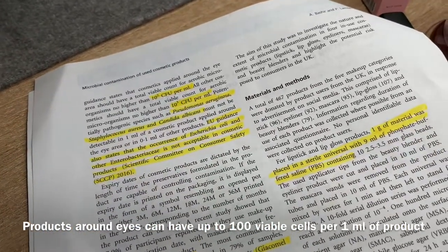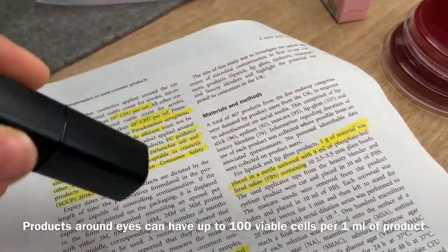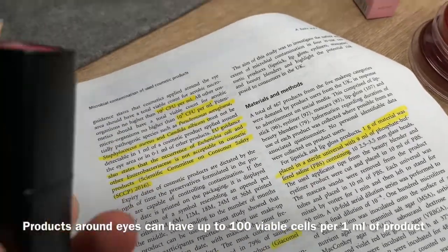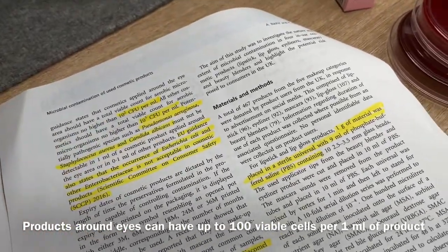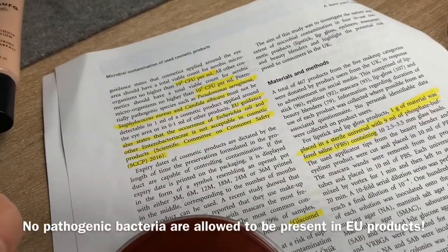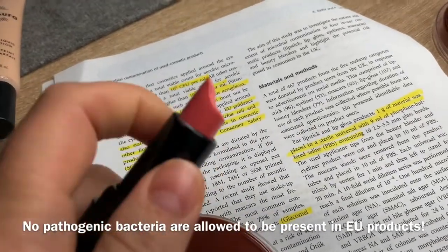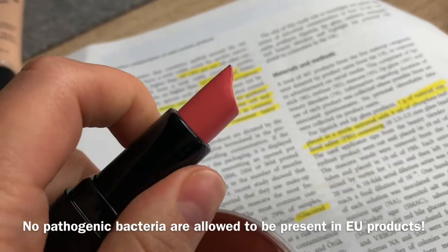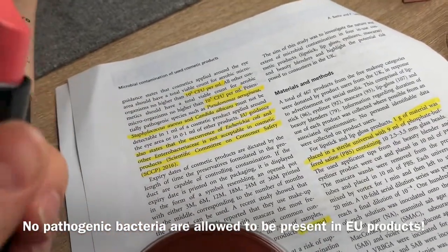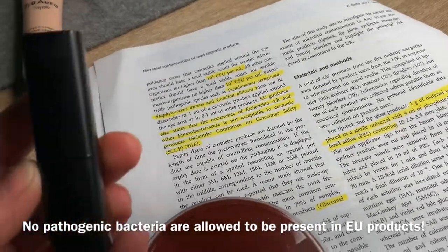You can expect in everything else like lipstick about 1,000 bacterial cells per milliliter. This was not a perfect experiment, but considering how many I got just by streaking, I don't think there are many. If I took a piece of the lipstick, I don't think I would get so many different live bacteria in there. Most of the bacteria would be on the surface anyway.